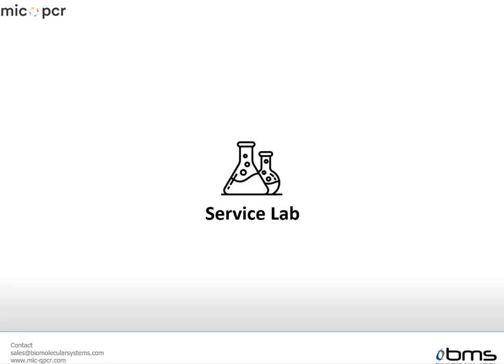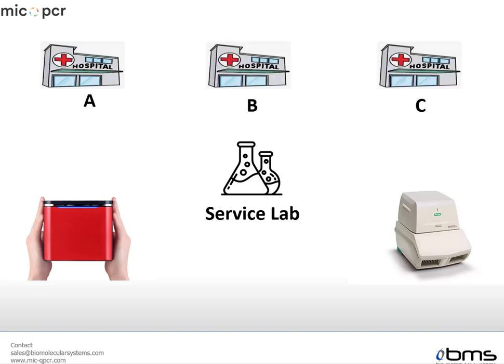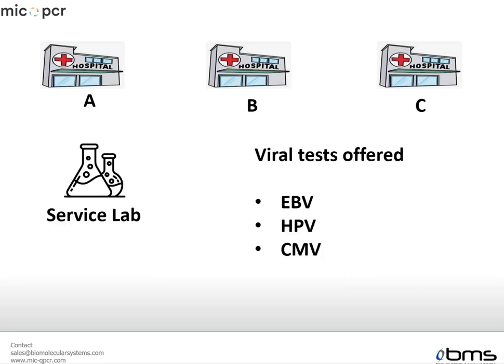So let's assume that you operate a service lab in which you use both the MIC and a Bio-Rad CFX. Among your customers there are three hospitals, Hospital A, B and C, and you offer viral testing to these hospitals. So the viral tests offered are EBV, HPV and CMV.